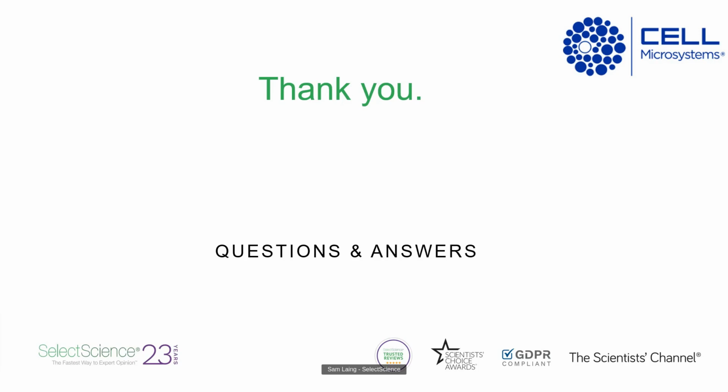Thank you. And another question I've got here is, have you used this technology for screening primary immune cells, for example, antigen-specific B cells? Yes, actually, we have.